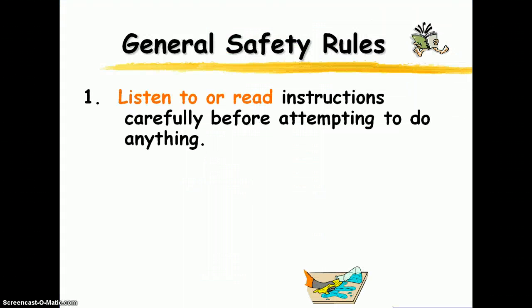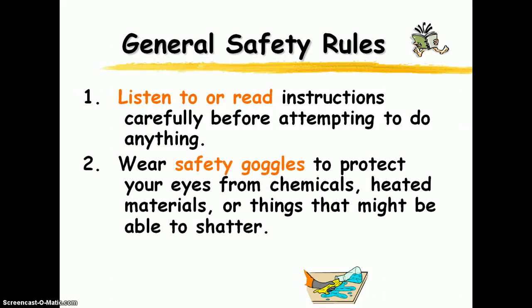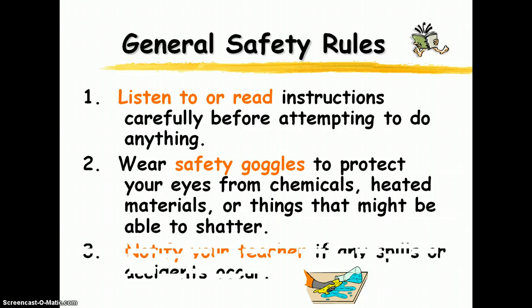Okay, some basic general safety rules. The first one is make sure you listen to or read all the instructions before attempting to do anything. I know there's that tendency to just jump right in — we all have that desire — but make sure that you read the instructions before you get started. Wear your safety goggles. I'm going to say this several times. The safety goggles in my class are really snappy looking — neon colors. Beyond looking cool, you're going to be safe, and you may end up with those little special lines on your face that indicate to everyone you've been in a very excellent science class.